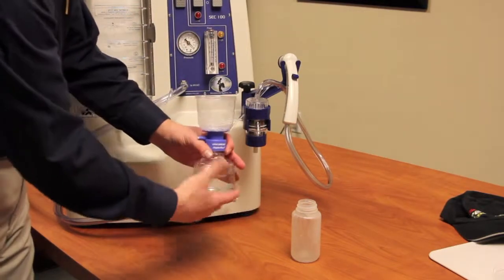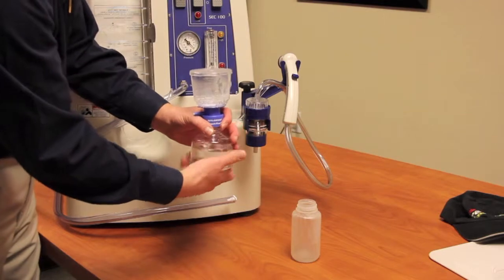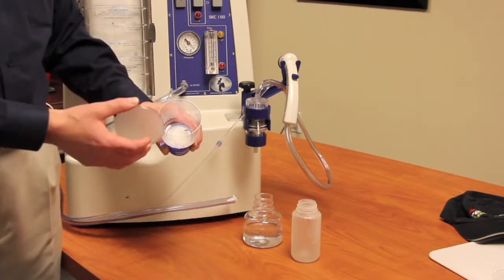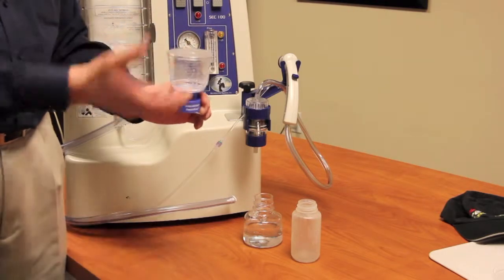Again, there shouldn't be anything inside the filtrate down here. All the DNA should be on the filter, which is inside the cup. So again, once that dries, they'll be ready to process it.